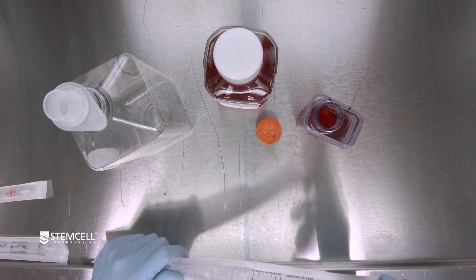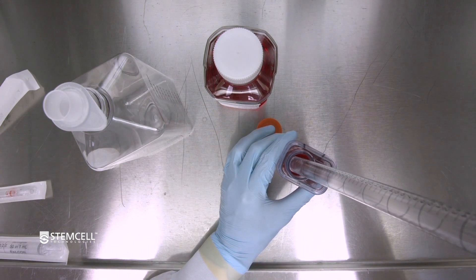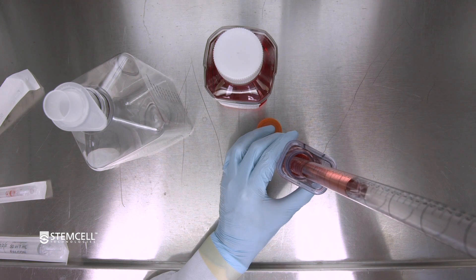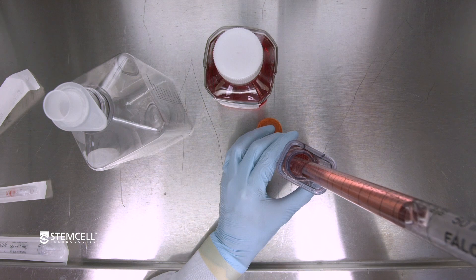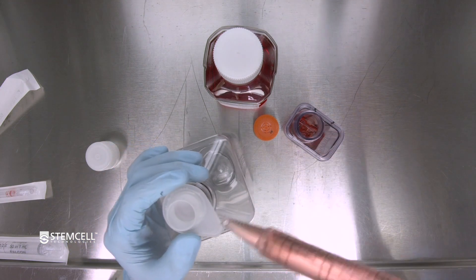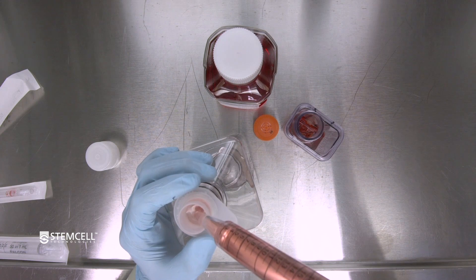Next, aspirate 50ml of spent media using a 50ml serological pipette. Ensure the pipetter is set to slow speed. Pass the spent media through the filter and into the waste bottle.